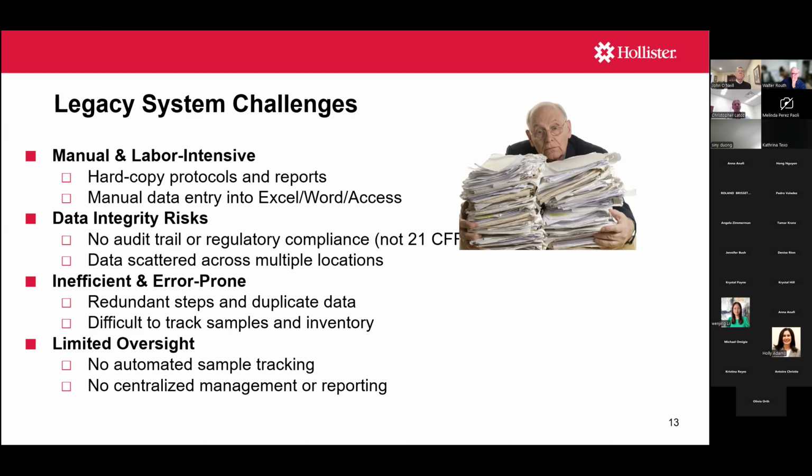As you can imagine, with this manual system, it was very difficult to track samples and have an accurate sample inventory. So what we did is we had sheets mounted on each of our stability chambers, and it was the responsibility of the technician to update those chamber logs.